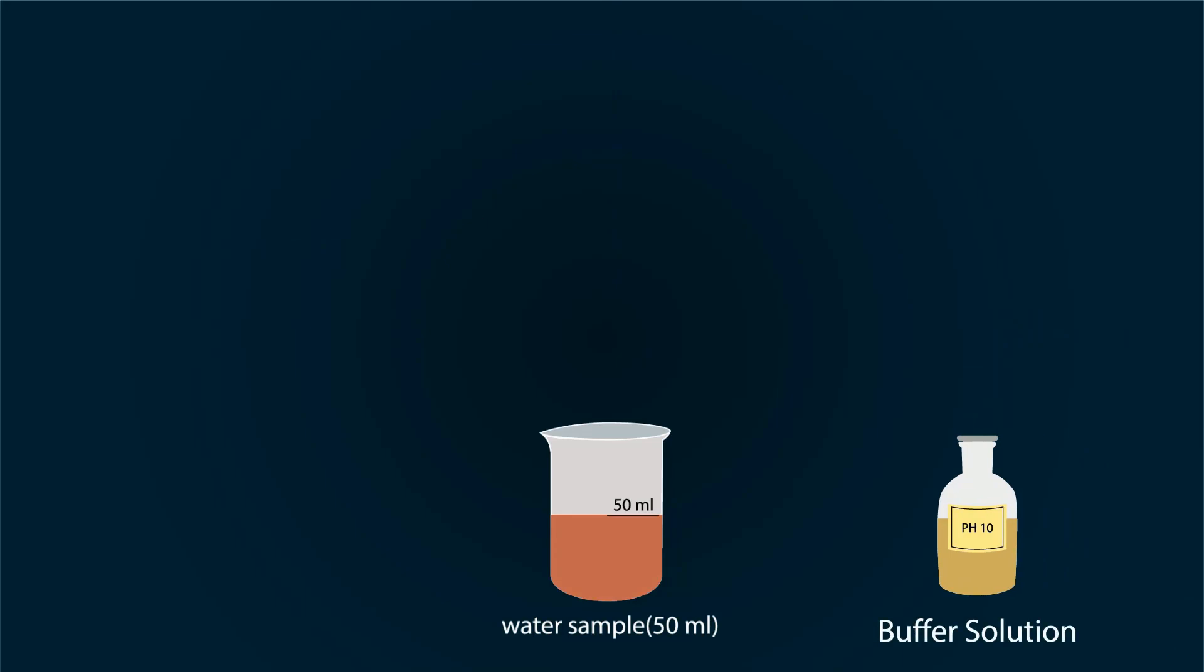Now take buffer solution which has a pH value of 10. Take 5 milliliters buffer solution with the help of a pipette and put it in the water sample. By adding buffer solution, the color will not change.